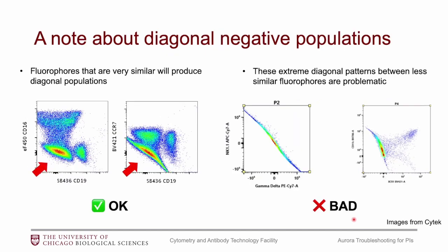There is one pattern that may not be familiar but is somewhat expected in spectral data. If your negative population has a diagonal pattern, this indicates that the fluorophores on the two axes are very similar to each other — for example, Super Bright 436 versus BV421 or Super Bright 436 versus eF450. These fluorophores are extremely similar; you cannot separate them on a conventional cytometer. So this diagonal pattern is actually expected. However, if you see this diagonal on fluorophores that are not similar — such as PE-Cy7 versus APC-Cy7 or BV421 versus BV786 — there's something going on that we need to dig into further.